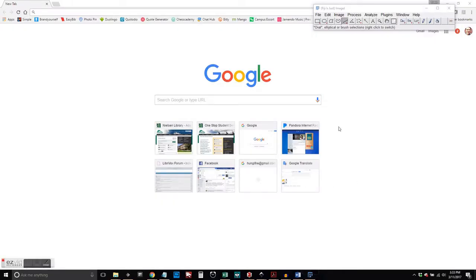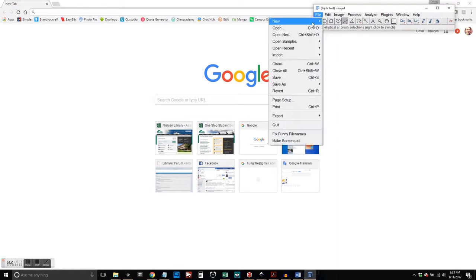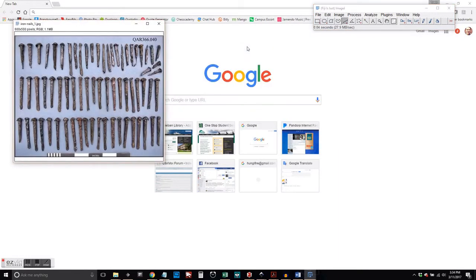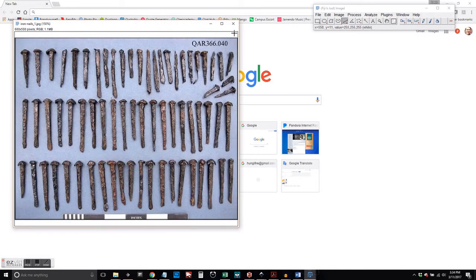Okay, so you've got ImageJ. Go ahead and open up your image here. We've got our picture of nails.